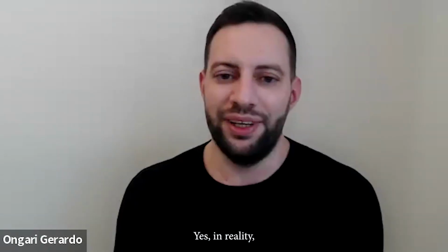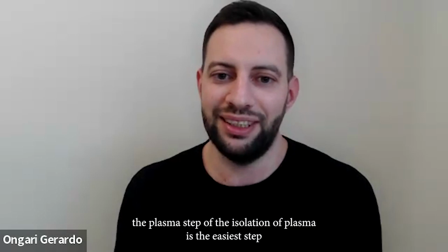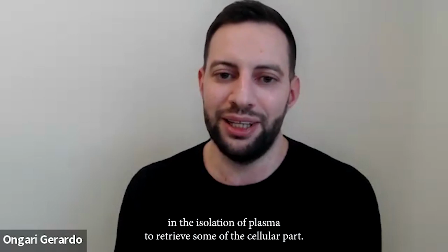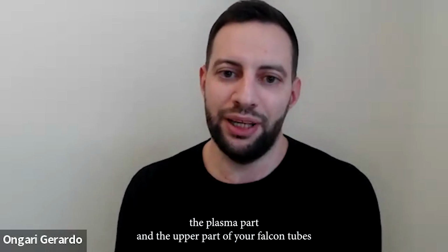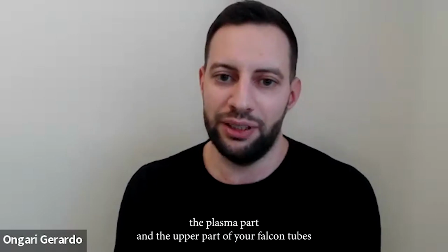Yes, in reality, the plasma step, the isolation of plasma, is probably the easiest step of the protocol, because the only mistake that you can make during the isolation of plasma is to retrieve some of the cellular part. So after the centrifugation, you'll have two parts, the plasma part in the upper part of your Falcon tubes and the cellular part below.